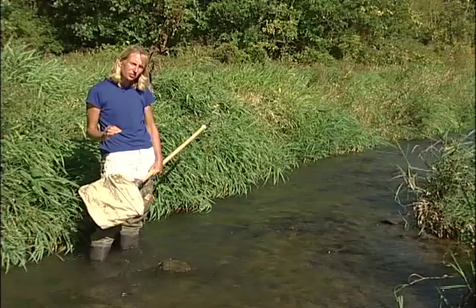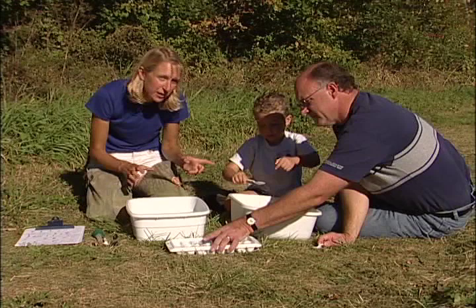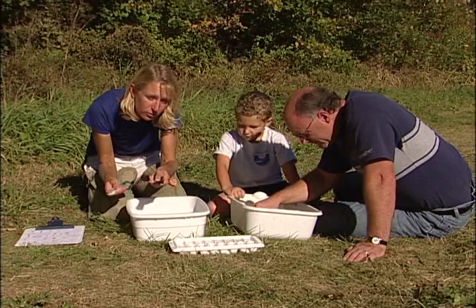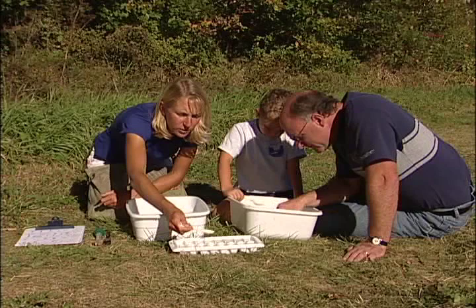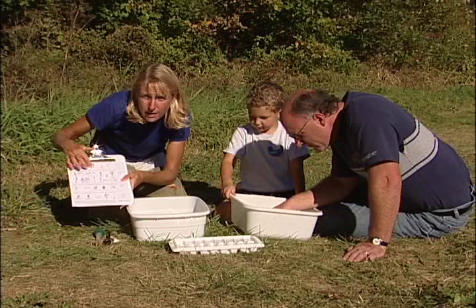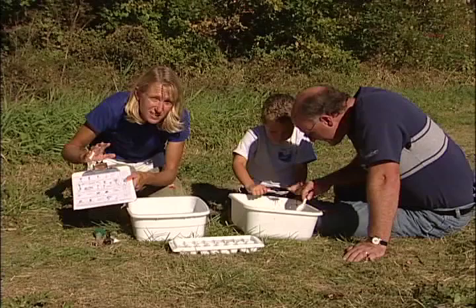Now that you know how to collect your sample and from which habitats, we'll show you what to do next. The next step is to sort the macroinvertebrates from the sample debris. There are a number of tools you can use, including a paintbrush, a baster, or a spoon to scoop up and under the macroinvertebrates, and to sort similar-looking macroinvertebrates into different cubes of the ice tray. Once you've sorted your macroinvertebrates, you can use the biotic index recording form to circle the ones you find. The index is based on presence and absence, so you don't need a total count of each organism — you record it the same whether you find one or a hundred.